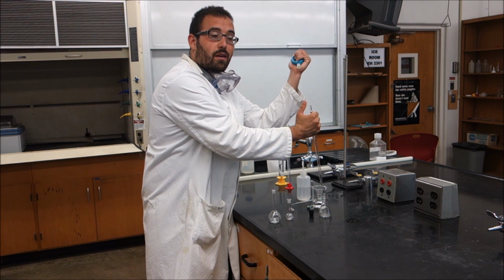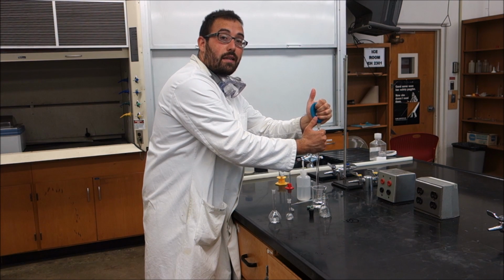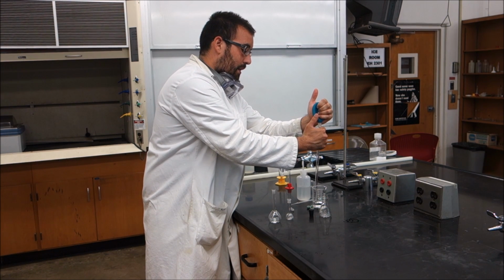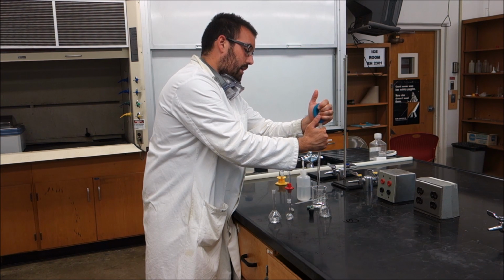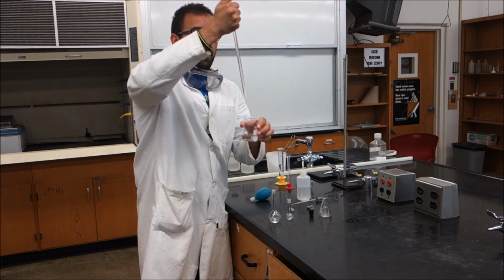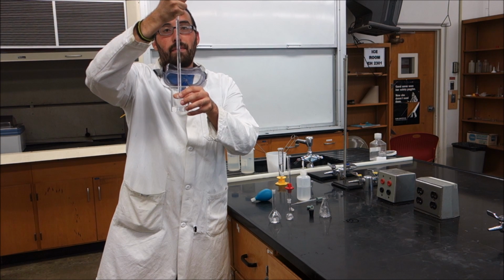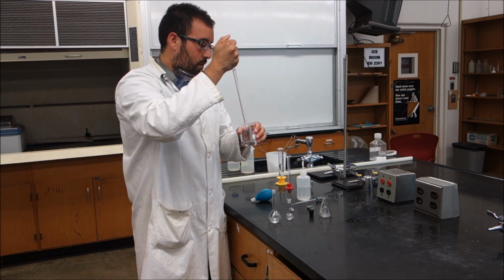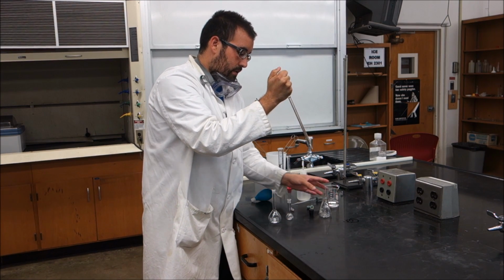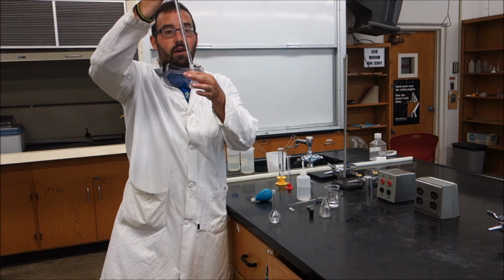We're going to squeeze our little stress ball / safety bulb, put it over our pipette, insert it into our liquid. We're going to let it suck up a little bit, and then we'll try to get it to about the 0 mark. Now, if we go over that mark, we can always release our finger and get it back down. And once it's at the 0 mark, we will transfer 2 milliliters of it into our volumetric flask.